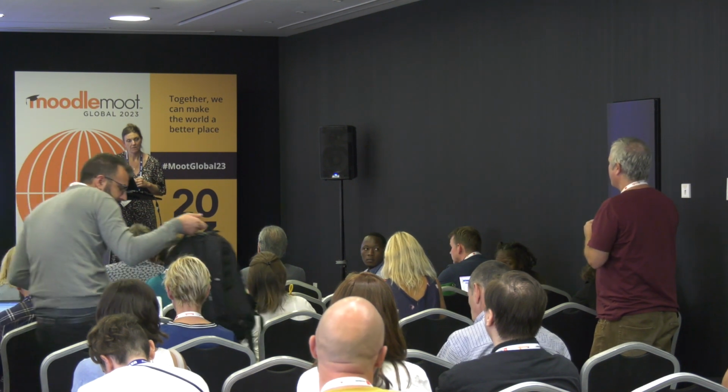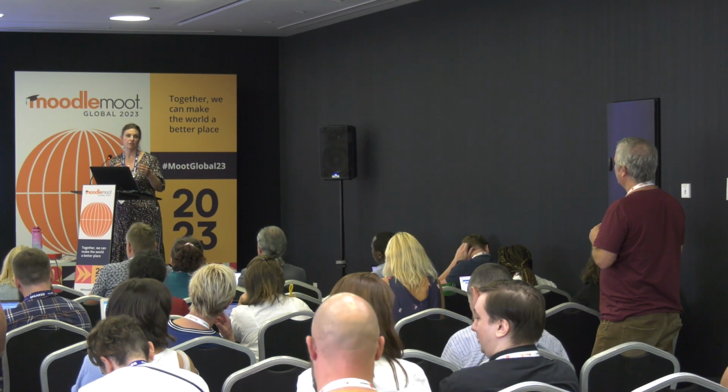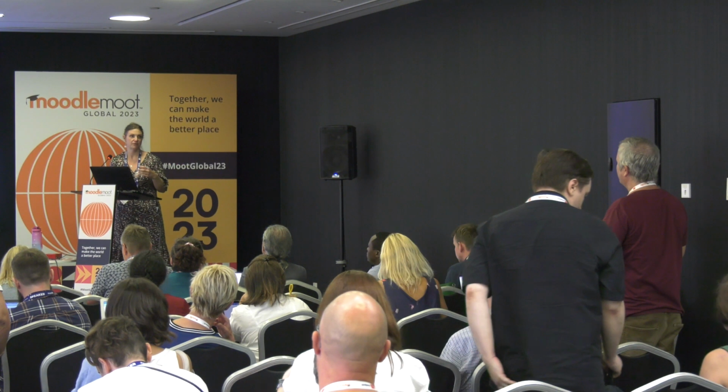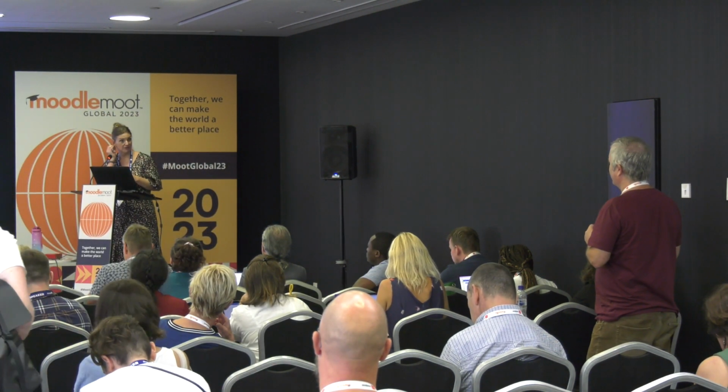Another one to follow up. Is everything preset, or can a teacher or instructor set up an experiment for the student, play with all the parameters, decide the solutions, whatever? Can the teacher set up the chemistry experiment, the solution, the measurements? Oh, yes. Not the teachers themselves, it's done by the faculty, and then the tutors will be there to support. We've got a chemistry lab with the physical chemicals set up, and we do have teams go in to reset all the chemicals in the morning or whenever it's been used. I see. Thank you.